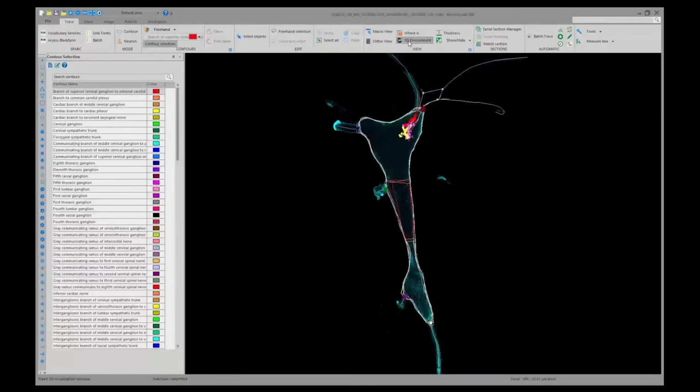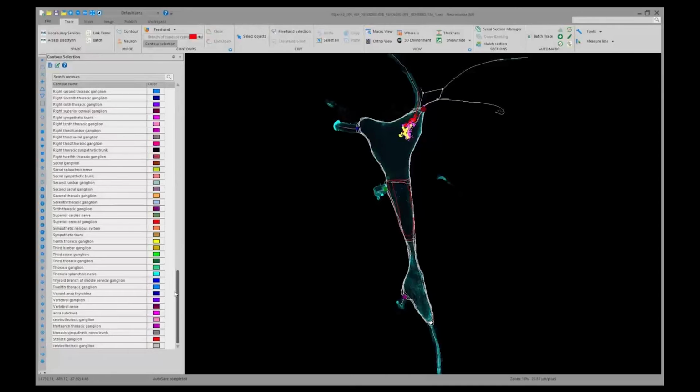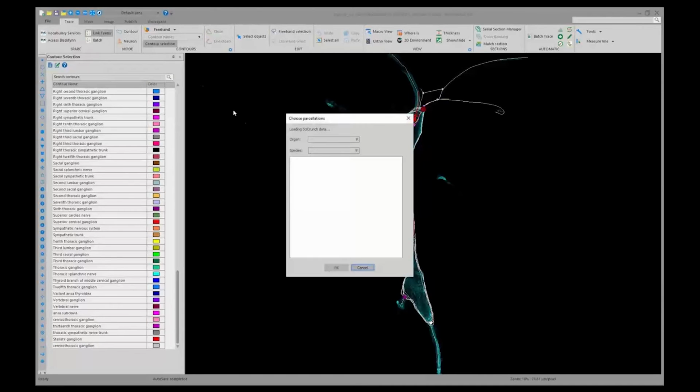Now I'm going to show you how to update existing segmentation data. The linked terms workflow allows users to recognize SciCrunch term names and write unique identifiers to the data elements to help make your segmentation FAIR. And you'll notice in this data file that I have a contour for the stellate ganglion in gray and one in red. And these terms have not yet been linked. And so we're going to update those and link them to a SciCrunch term using that linked terms workflow.